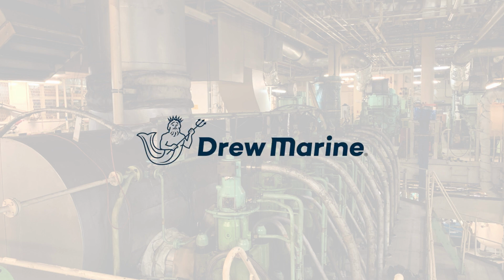This concludes the tutorial video on testing the boiler water neutralized conductivity using the conductivity meter. For additional instructions, reference the appropriate control test card or contact your Drew Marine representative.